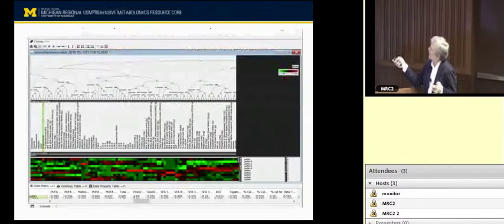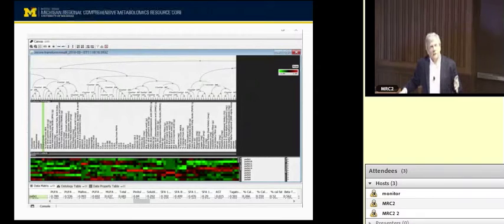I showed you this before. This tool that we'll show you also allows you to cluster things. Although we didn't ask the people about their diet at baseline, we asked nutritionists to take the diet that we fed everybody and do a dietary recall as if they had provided the information, so blinded individuals who didn't produce a diet. And then we took that dietary recall and clustered it with the metabolite levels. And it actually sort of works.